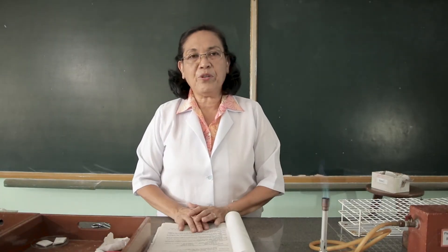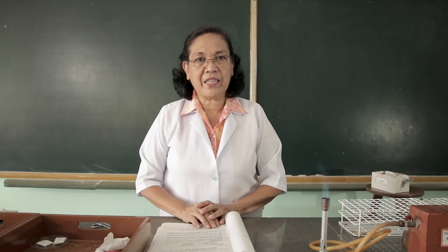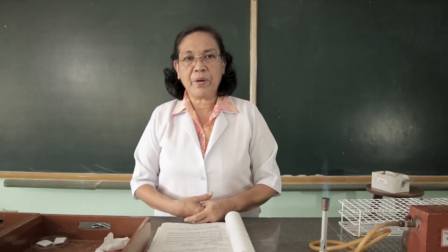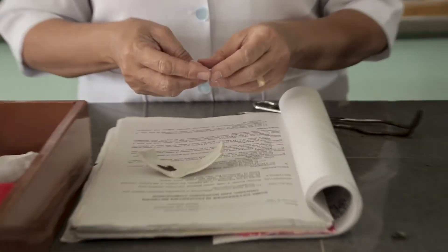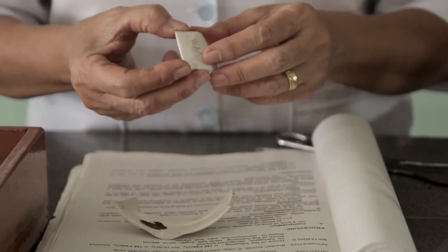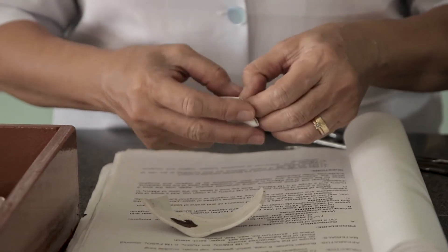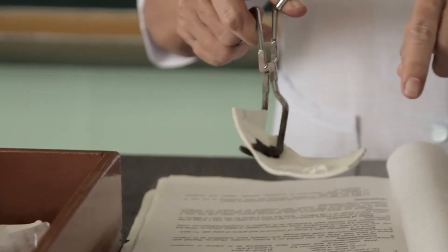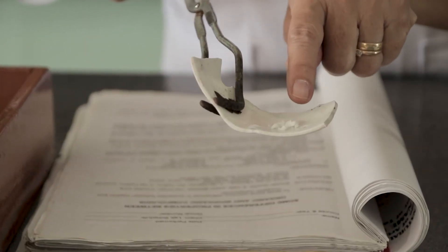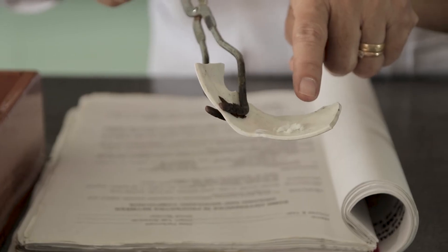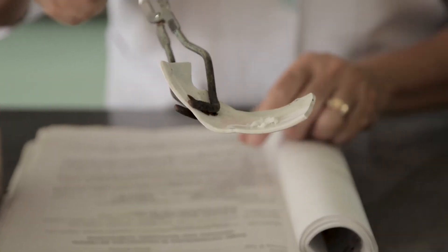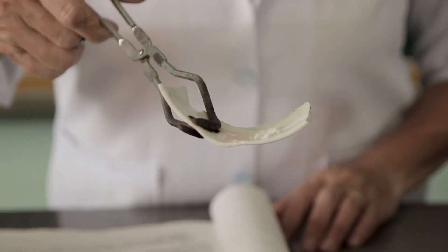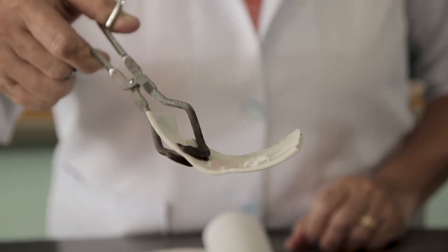The next property that we are going to prove is combustibility. What do we mean by combustibility? This is the ability to be burned or to get burned. We are going to heat this piece of wax. Kindly observe what happens to the wax when it is being heated. We are going to prove the combustibility of this substance, wax.